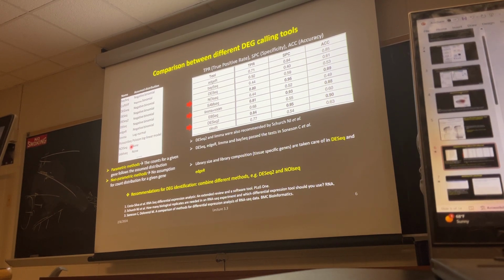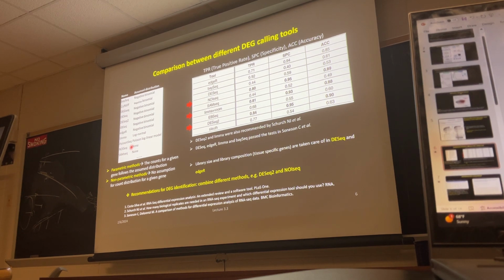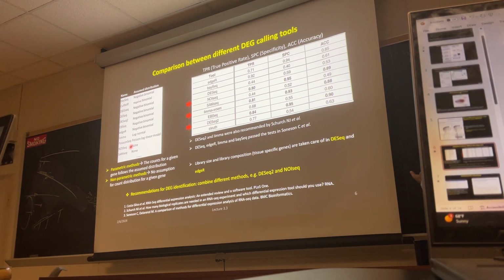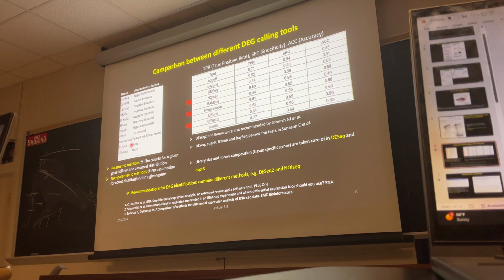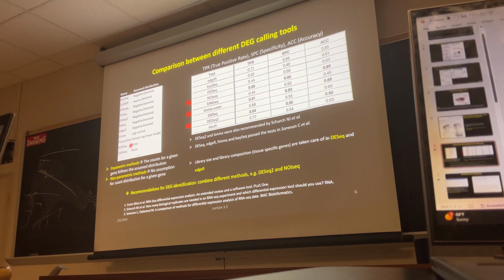First thing it does is convert all these values into log values. Whenever there is an expression of 0, meaning there is no expression, then if one of the samples has an expression of 0, that gene will be removed from the analysis in DESeq2. Last week I was talking about sequencing and the library composition, that's the composition here.